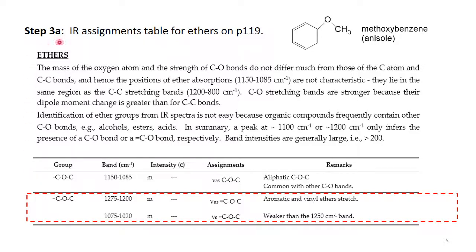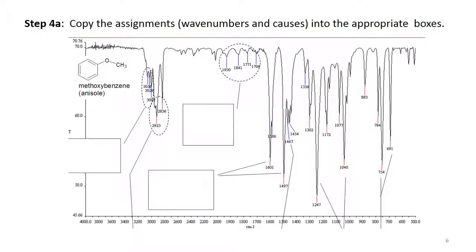Here is the IR assignment table for ethers. Note that aromatic and vinyl ethers have an asymmetric C-O-C stretch between 1200 and 1275 wavenumbers, and a symmetric C-O-C stretch between 1020 and 1075 wavenumbers. Here is the scan of methoxybenzene where you can identify these C-O-C stretches as well as the other fingerprint bands indicative of a monosubstituted aromatic ring.